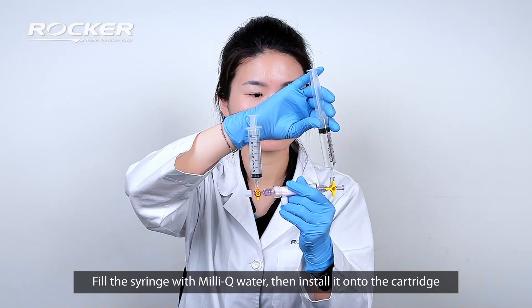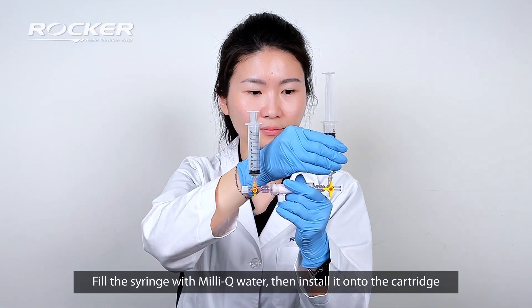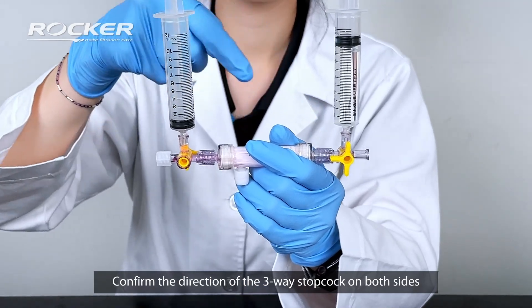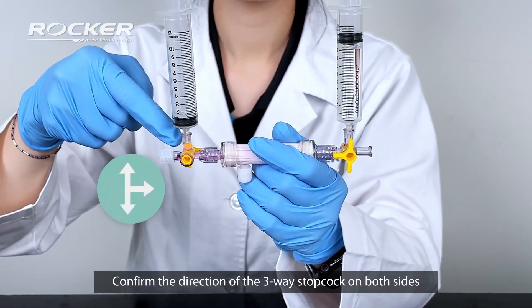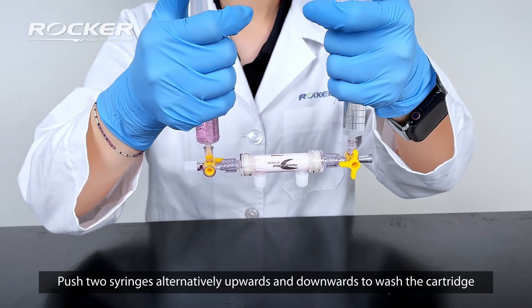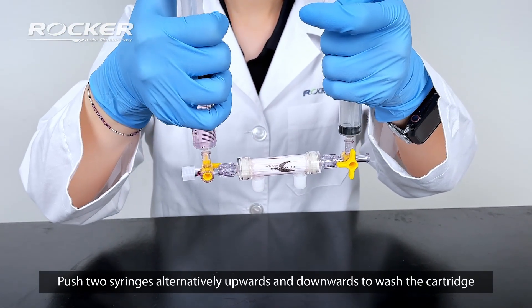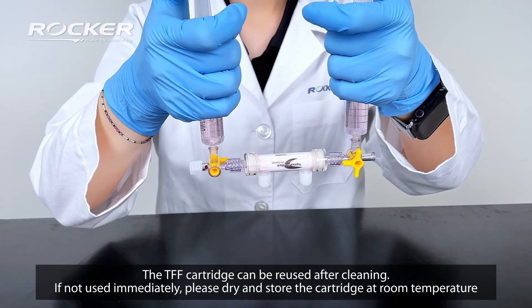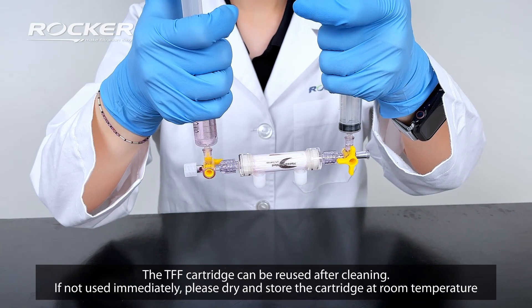Fill the syringe with Milli-Q water then install it onto the cartridge. Confirm the direction of the three-way stopcock on both sides. Push two syringes alternatively upwards and downwards to wash the cartridge. The TFF cartridge can be reused after cleaning. If not used immediately, please dry and store the cartridge at room temperature.